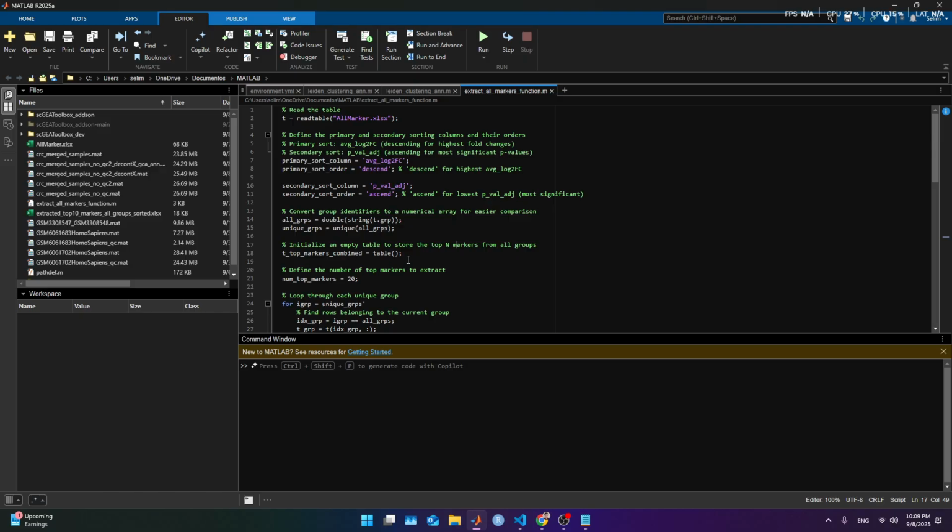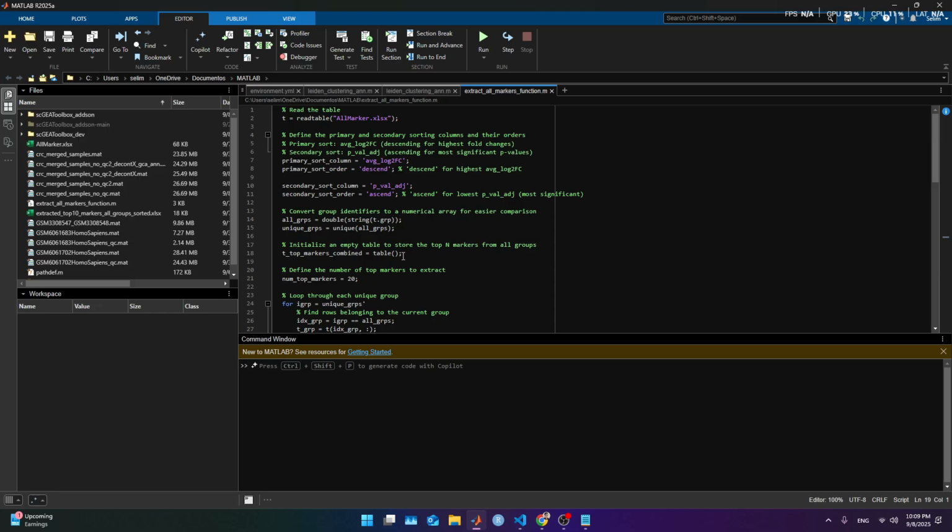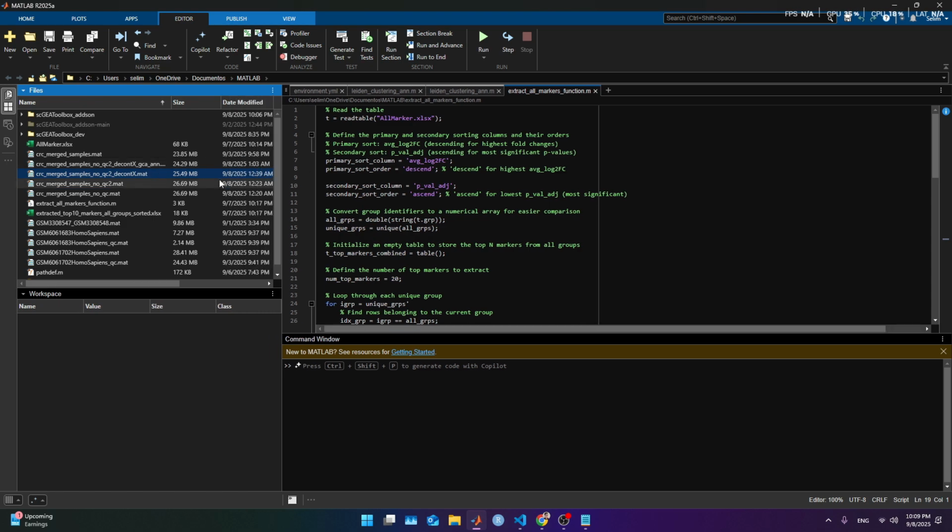The previous video was about finding gene markers for the current sample we have. We are working currently with the colorectal cancer adenoma-carcinoma and polyp progression dataset with just 2 samples, and I figured out something that I'm gonna show you guys today. So far, we are gonna do this.